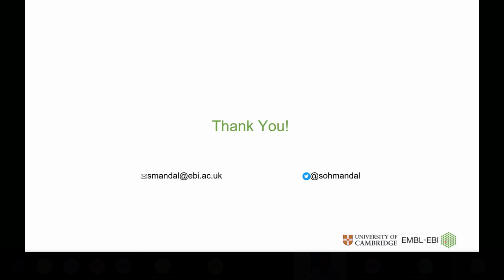But practically speaking, I'm not quite sure how to put it into words, but something that has tons of spiky shapes might be a bit tricky to segment with SplineDist as of now. But as I mentioned, this is not a problem for the object model. This is rather a problem for the backbone. So if it's possible to get a good embedding out of the image, then the spline model can very well tackle any kind of shape.